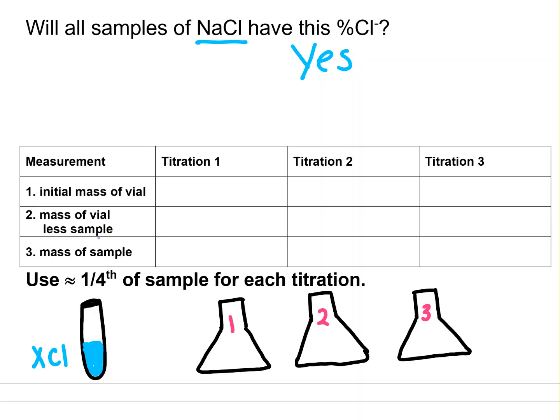The first thing is that we may call our test tube, or we have a tube, we may call it a vial, it may be more of a tube, just be aware of that. Okay. And instead of weighing how much we get in weighing our flasks, our 3 flasks for our 3 trials, we're going to weigh our container.